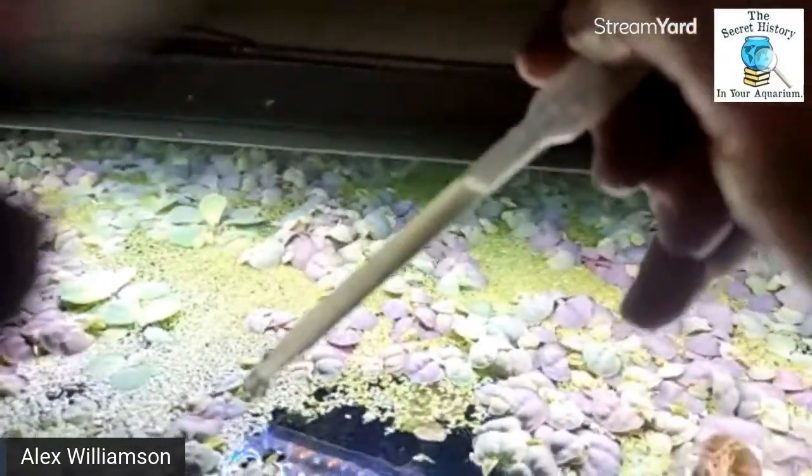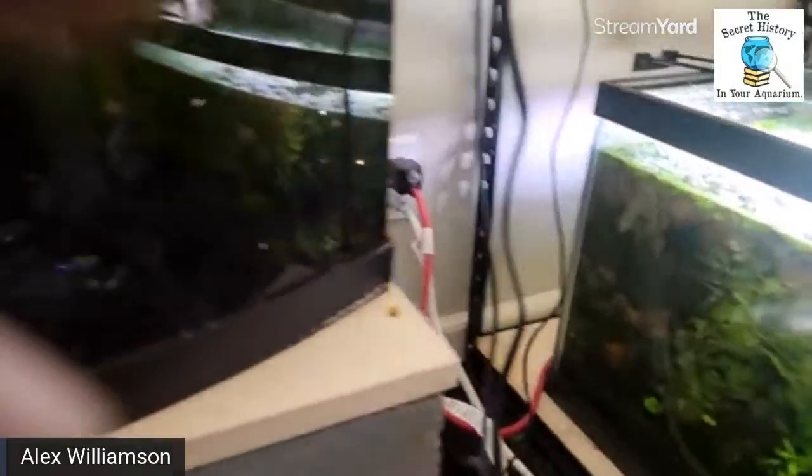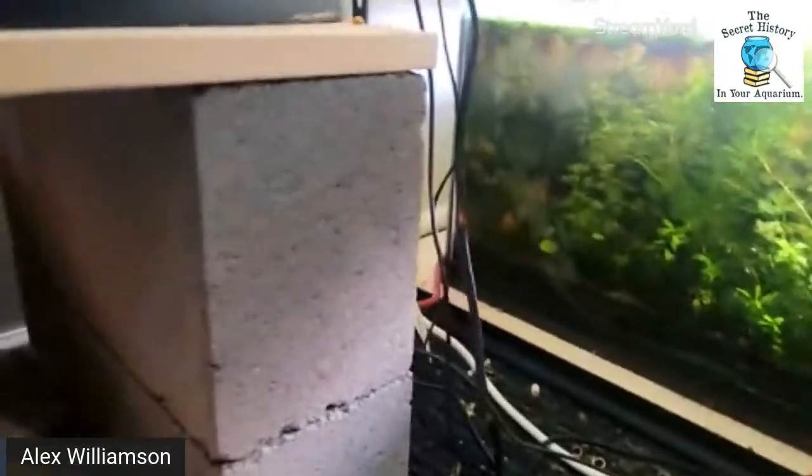Now, let's go down into this tank, and we'll see what we can see. We're going to take the pipette. Let me roll my sleeves up. Sorry, guys. I know it's bouncy tonight. But we're going to kick up some mulm. Kick out the mulm! All right. There's a good sample of puffed up mulm from the bottom of a very planted tank. You know, see, the fish are actually eating whatever it was I kicked up. Let's see what they're picking at. All right. Let me hook you guys back up.